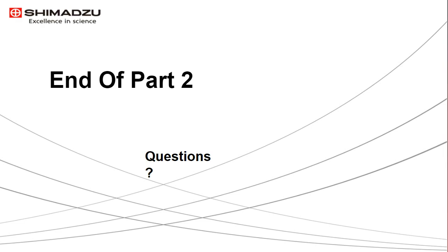Great, thank you. The next question is about butterfly wings. All right, this will be exciting. How did you physically mount the butterfly wings for the sphere? This is going to be horribly anticlimactic. You take the butterfly wing and you get double-sided tape from any art store, tape that is sticky on both sides, and you get a nice black piece of construction paper.